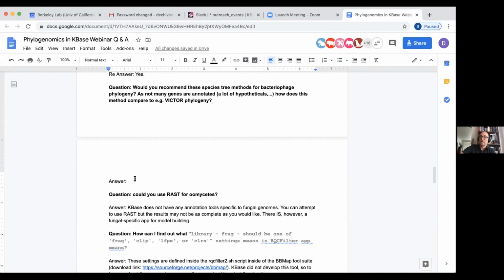And then concatenate those genes into MSAs, do MSAs, concatenate the MSAs, and then build the species tree of that concatenated MSA. That's essentially what's happening behind the scenes for the microbes, but it's using the phylogenetic markers that were predetermined for microbes as opposed to an on-the-fly pangenome calculation. It boils down to the same process. It's just manually implemented. I hope to have a pangenome to species tree thing on the soon side of things. It's absolutely something you'd want for viruses.